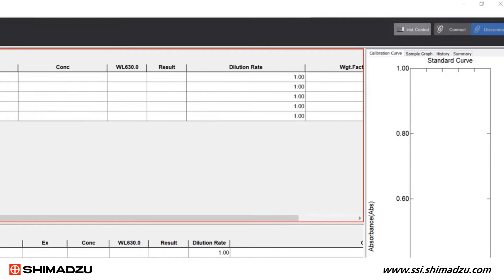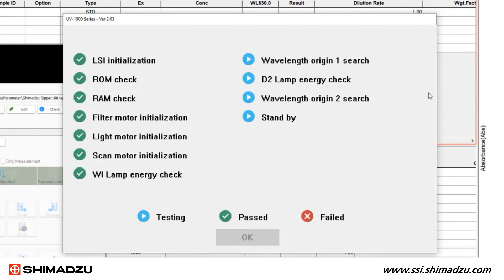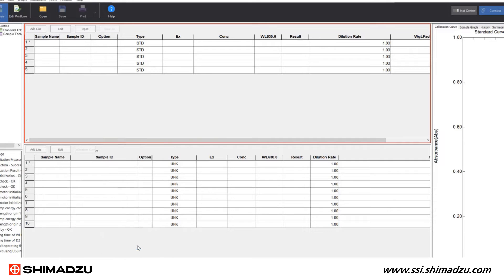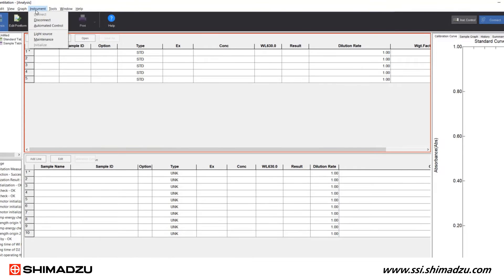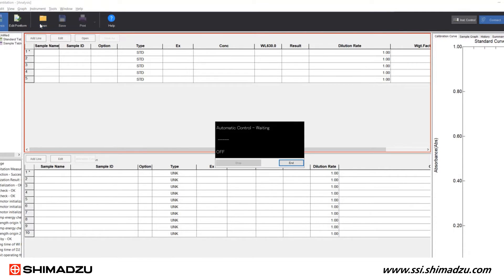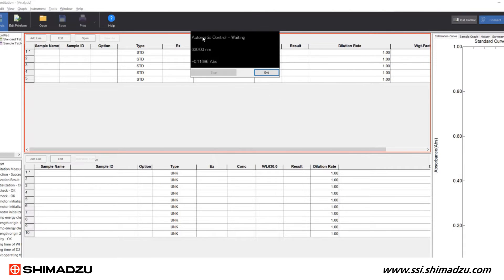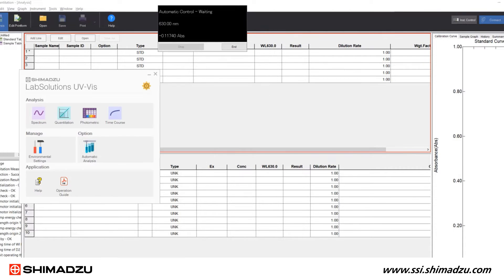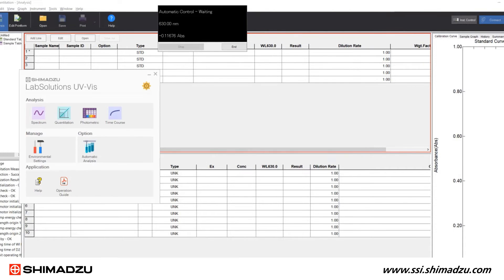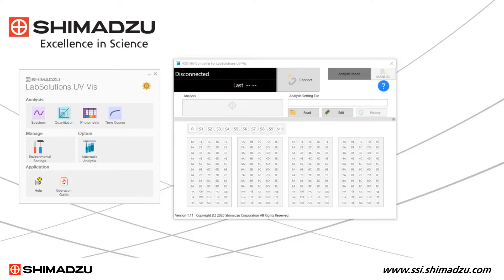Click Connect to establish communication with the spectrophotometer and close the Instrument Control pop-up window. Click Instrument and select Automatic Control — a small pop-up window will appear. From the LabSolutions UV-Vis launchpad, click Automatic Analysis to launch the optional Automatic Analysis module.